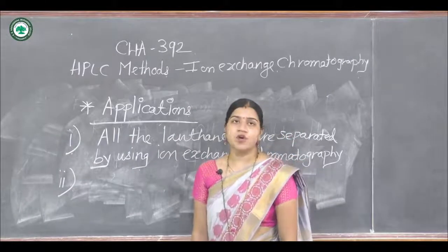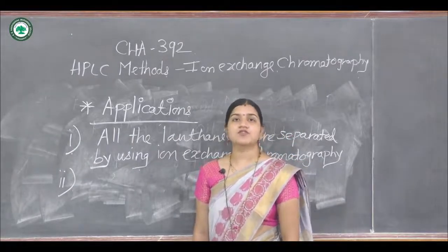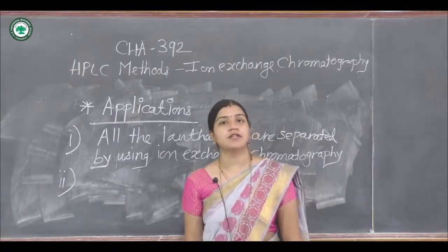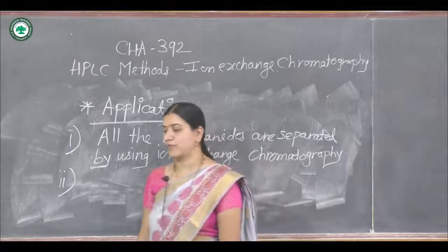For the analysis of all types of lanthanides, ion exchange chromatography is used, and all of them can be analyzed within 30 minutes.